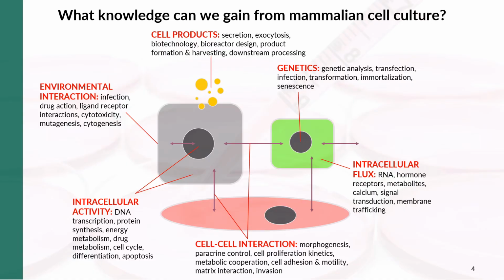Okay, so these environmental factors that you are playing around with in the cell culture can actually influence all these things, right? The cell behavior, the physiology, and this includes all the gene expression, the metabolism in the cells, and the different cell signaling that's happening in the cells. And also you can look at how the morphology of the cells changes over time. Lastly, you can look at cell products, meaning what are the various compounds that are secreted by the cells.